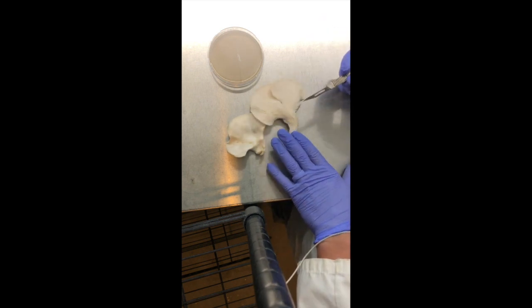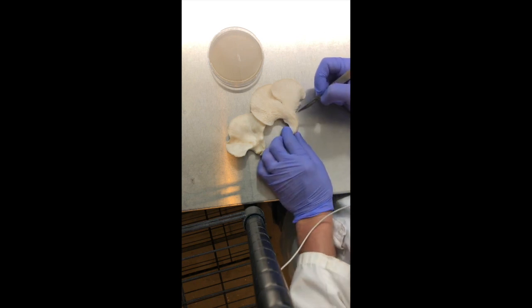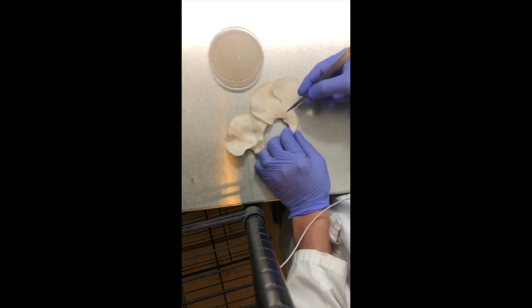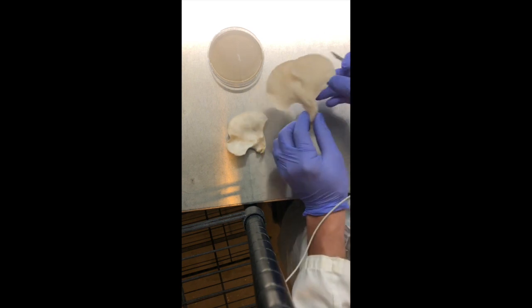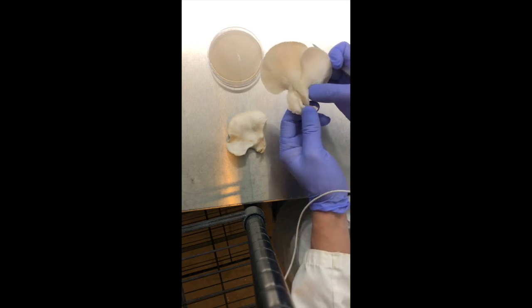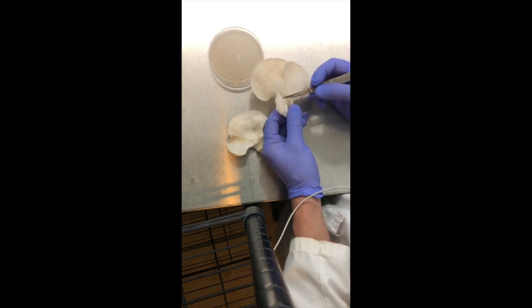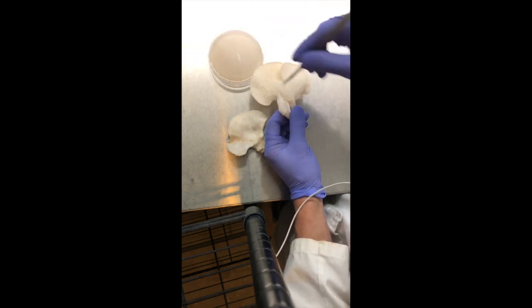The most important part about cloning a mushroom is that you want the tissue to come from the innermost part of the fruiting body. You want to take a sterile piece of tissue from within the mushroom and transfer that to the agar. I'm making an incision right before it hits the cap — that region, especially in an oyster before it fans out, is pretty dense.